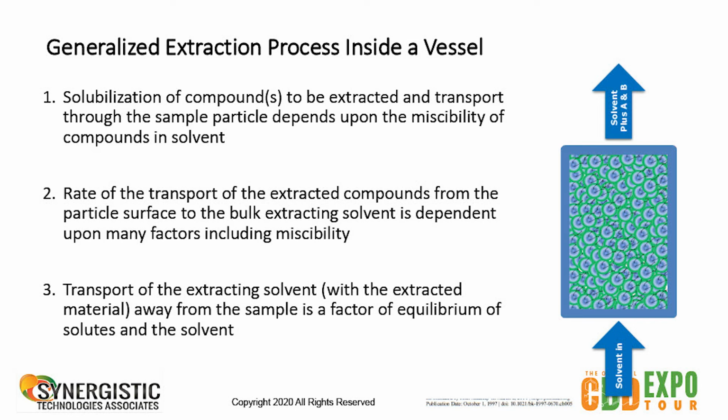Every time you walk through that entire transport, no matter how you're extracting, you're going to want to test the material before and test the material afterwards to know if you got all the material out of there. You don't want to be leaving CBDA inside your hemp media.